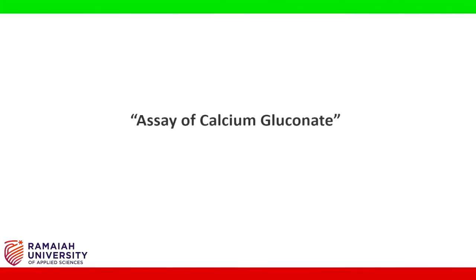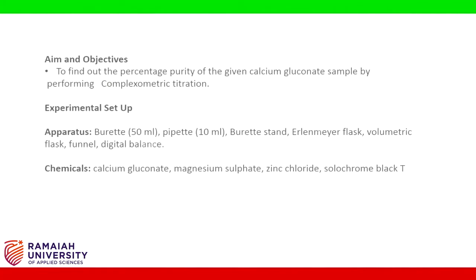Hi students, today we are going to see about assay of calcium gluconate. Aim: to find the percentage purity of a given sample of calcium gluconate by performing complexometric titration.